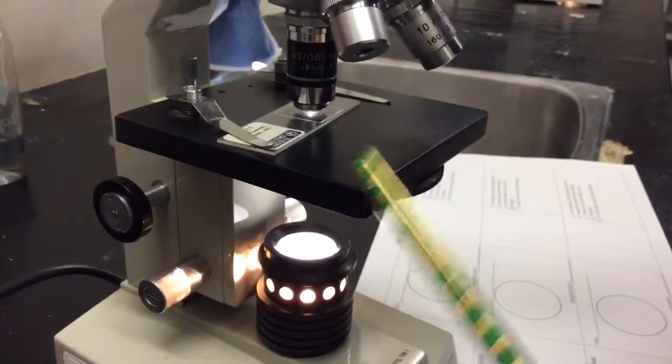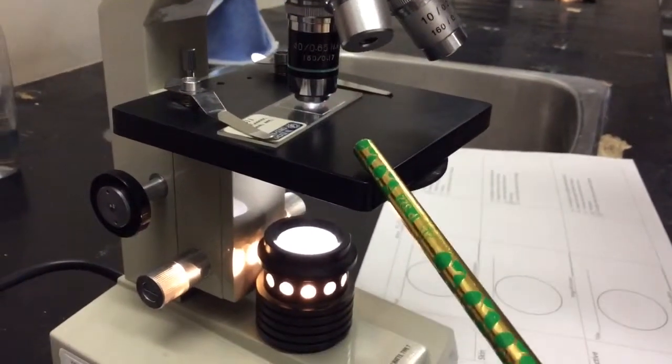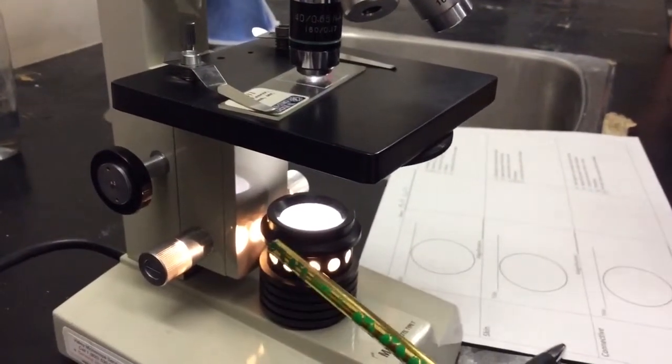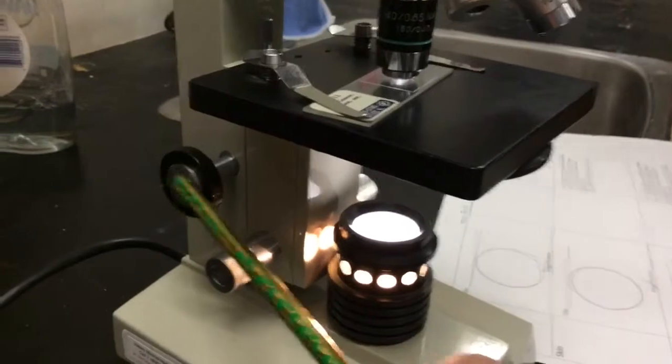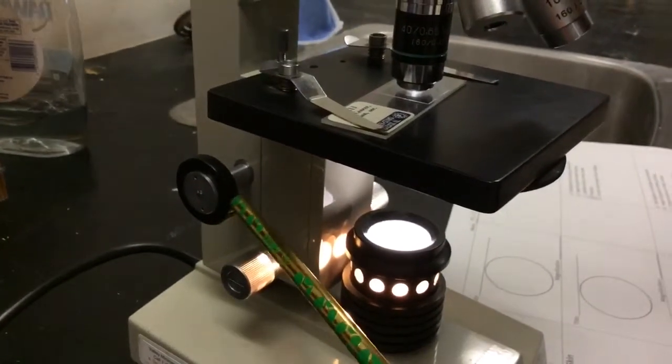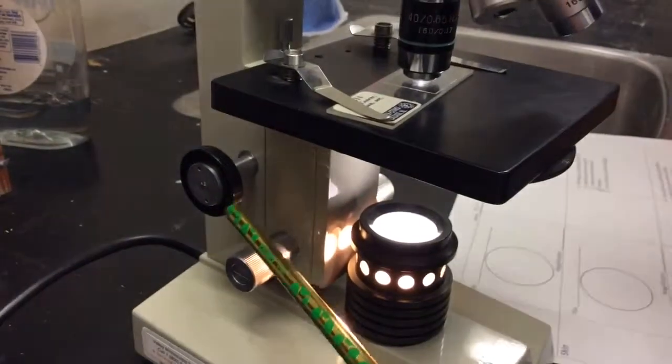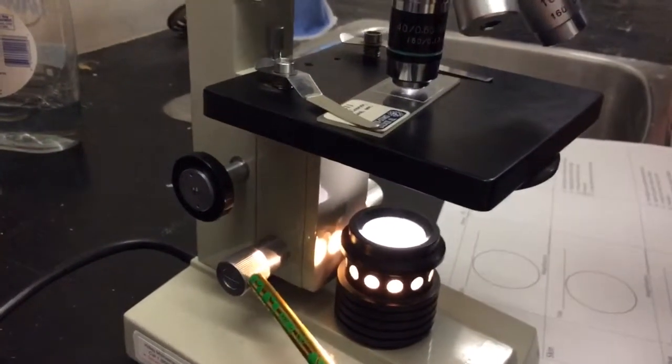What do we call this thing here? Oh, a stage. This is called the stage. What about this guy down here? That's a light. What kind of adjustment is this one? Is it the coarse adjustment or the fine adjustment? It's the coarse. And then this guy is the fine. Excellent.